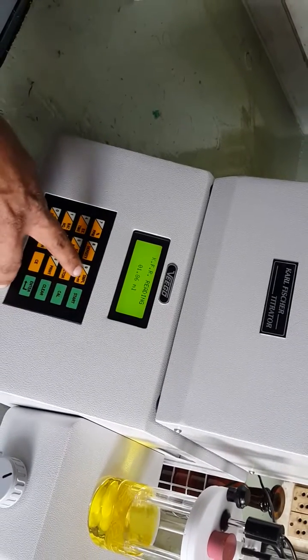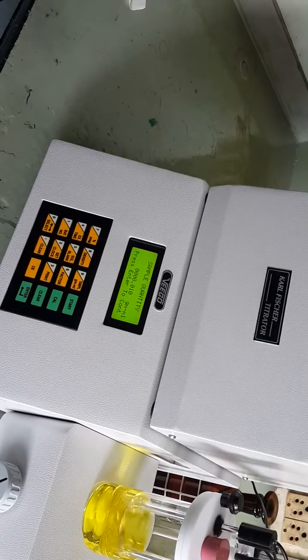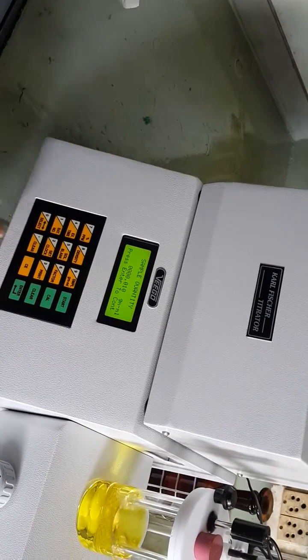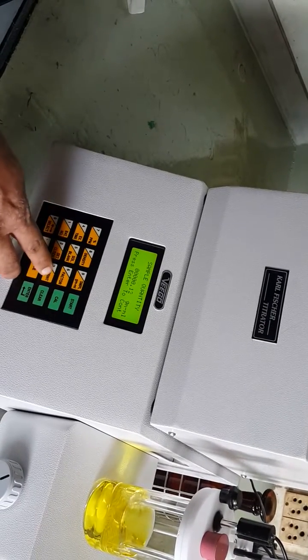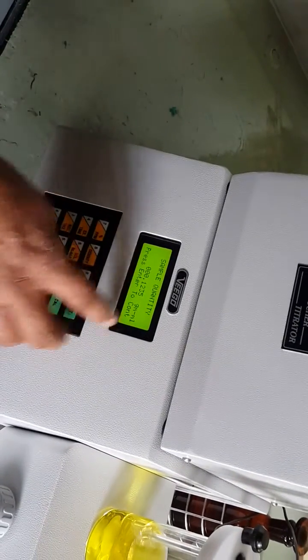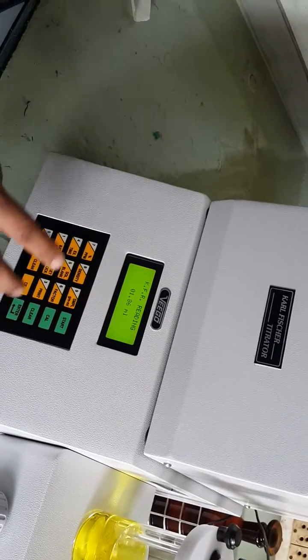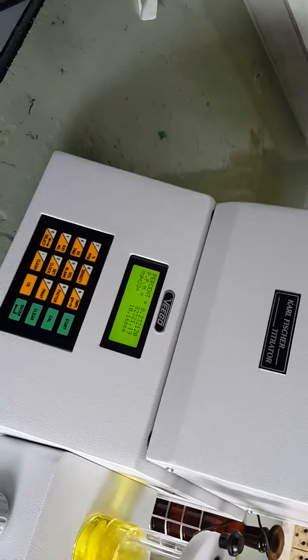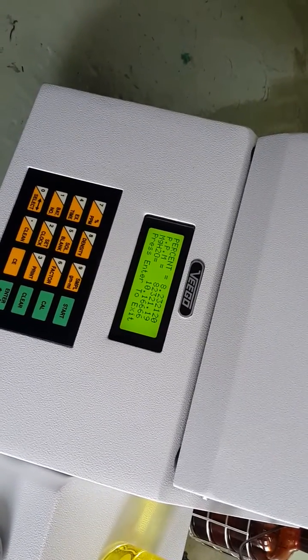To register the sample quantity, press the smpl key. It shows the message 'sample quantity' and displays the previously entered value. Enter 0.1235 for the 0.1235 grams of sample added, then press enter. The reading is 1.86 ml. Now press the %/ppm key to find the water content — it calculates the percentage of water as 8.23%.